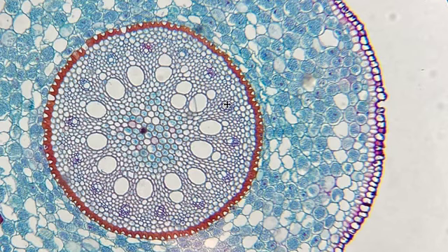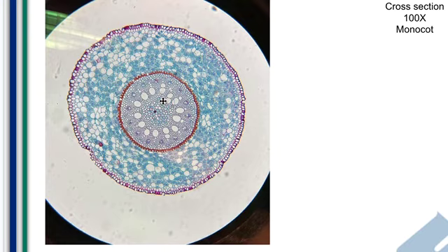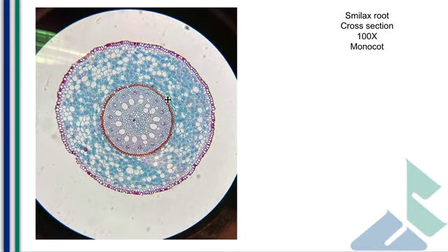They're characterized by a purplish color, similar to what we saw in our dicot root, where the color change was very distinct from our xylem. And uniquely, we do have a living layer of cells on the inside here, inside of the metaxylem, a bit of our pith.